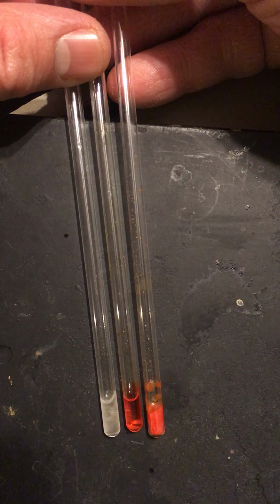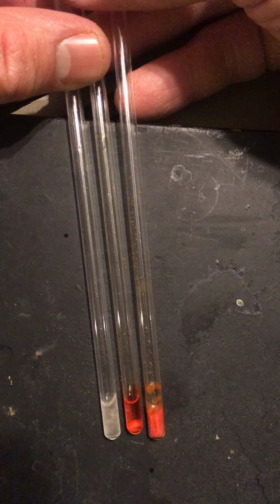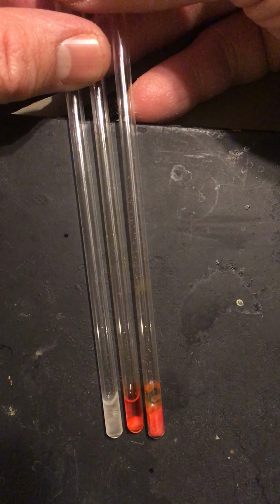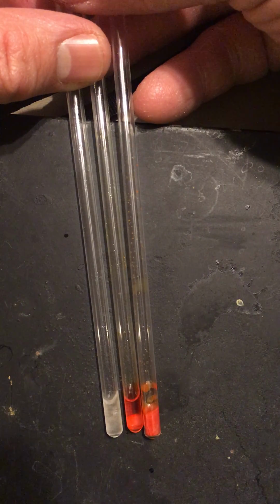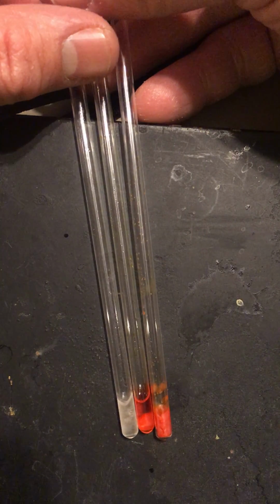And in the middle, I have a sample that's a mixture of eicosane and azobenzene, which is a liquid when I initially pull it out of my glove. But as you can see, as it sits here on this metal that's been out at room temperature, you can see that the sample is freezing into the solid state.